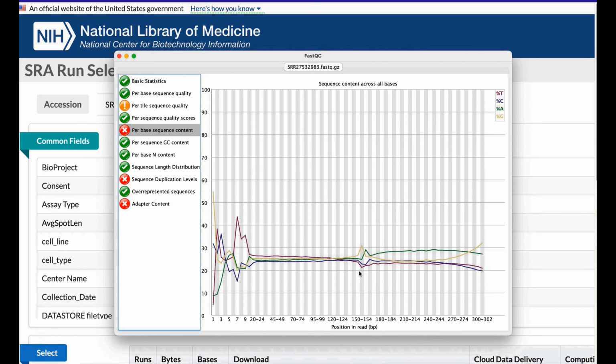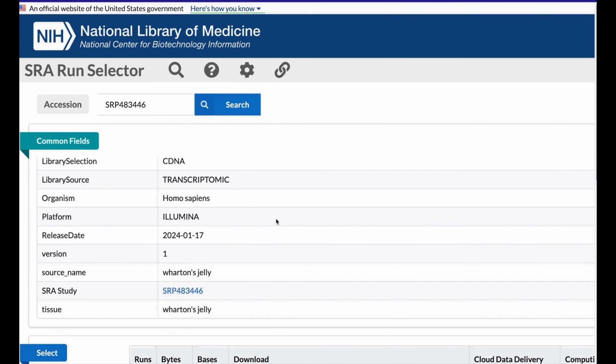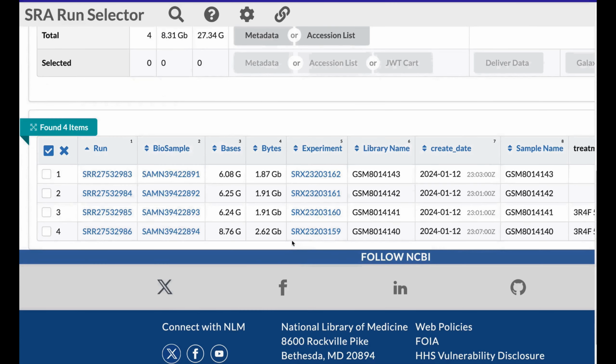And this bump in the middle feels like 2 sequences of 150 length were merged together, and so these are both ends of it. Whether I'm right or wrong, we can go to the original documentation to run selector with those 4 files at the bottom.